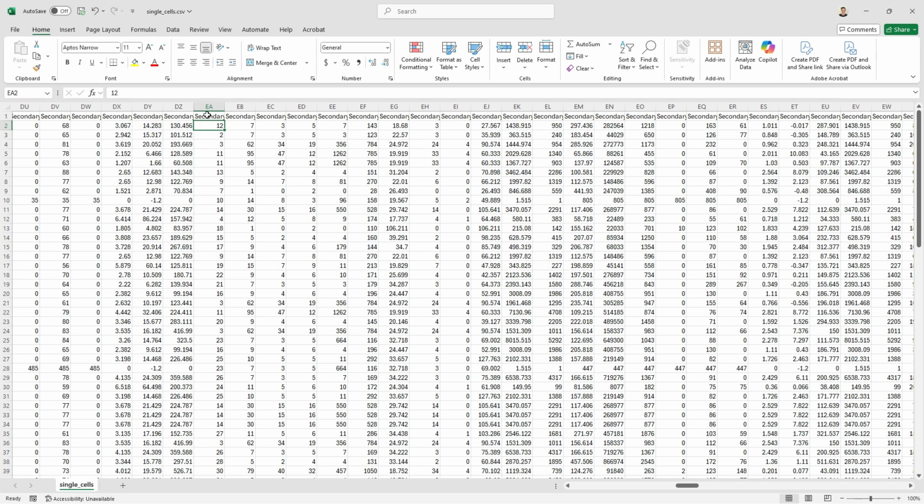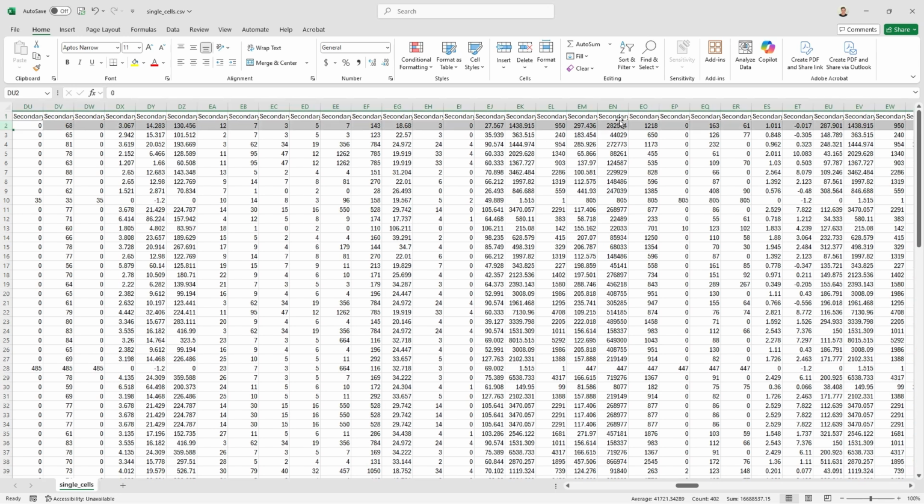So this is now the skeleton ID that has been matched back to the shape of the cell. And we have a number of metrics here. We've got the number of branches, the number of junctions, endpoint voxels. All of this information is available from the Analyze Skeletons plugin that's linked in the documentation. And so you can see the maximum branch length as well, which is really cool. If we keep on going, and again, everything in this row pertains to the same cell. So the skeletons are label matched back so that a single row still represents one biological entity.